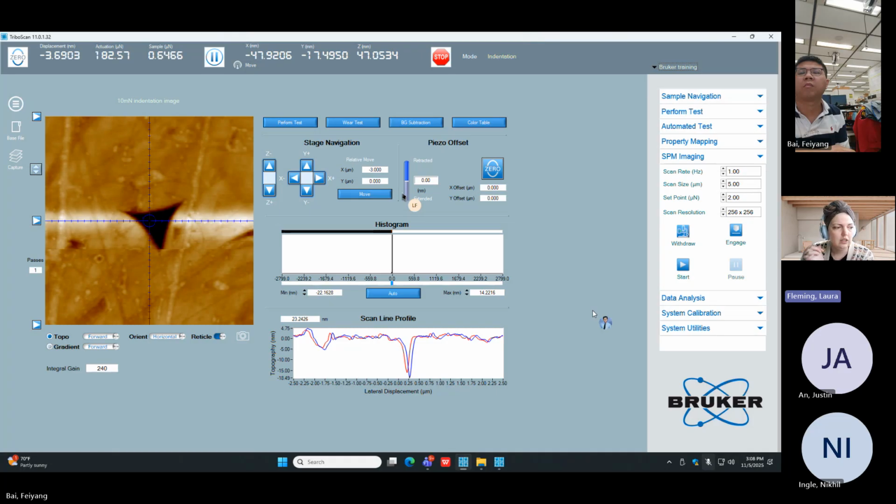So that's one thing. The other thing I think about when it comes to roughness is that we are using a Berkovich probe, which is a very, very different beast than an AFM cantilever, right? I'm pretty sure if you graph them next to each other, the cantilever would look like a knife and the Berkovich probe would look like a volleyball. It's just so wide. And so if you think about trying to image, let's say it's a step, right? And the step is narrow or it's rough and it's narrowly rough. There's no way that the probe's going to actually make it all the way down, right? It's going to come through and then move back on. So those are things to think about when you're thinking about how rough.